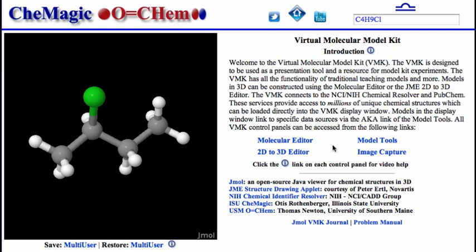The introduction provides access to four other control panels: Molecular Editor, Model Tools, 2D to 3D Editor, and Image Capture. While using the VMK is fairly intuitive, each control panel has an information icon that provides a direct link to a tutorial describing the features of that control panel.